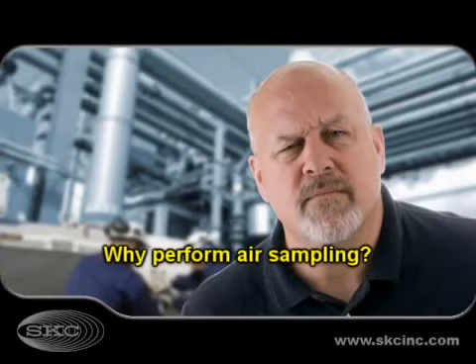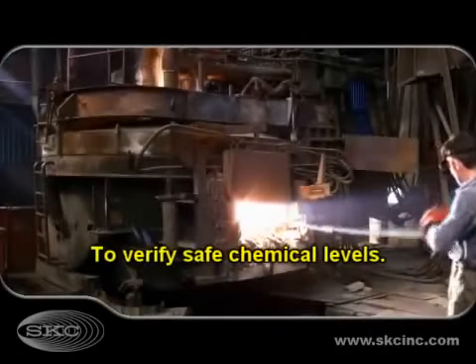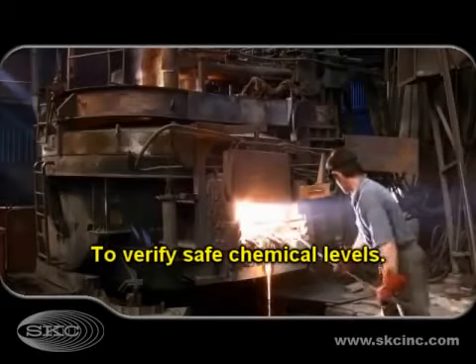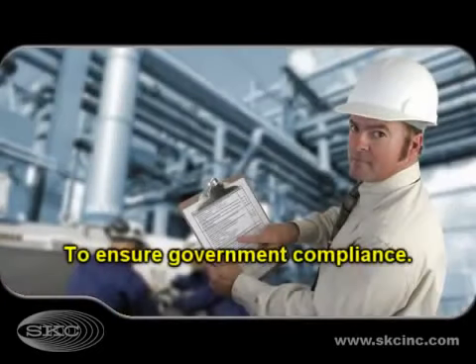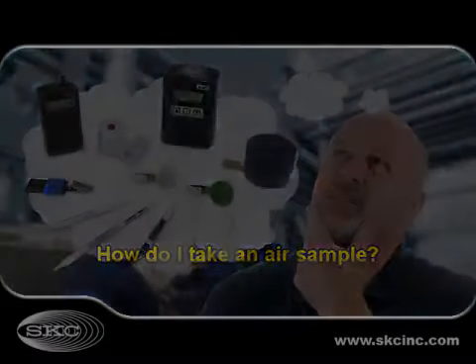Why do I need to perform air sampling? To verify chemical exposures are at safe levels. To ensure government compliance. How do I take an air sample?